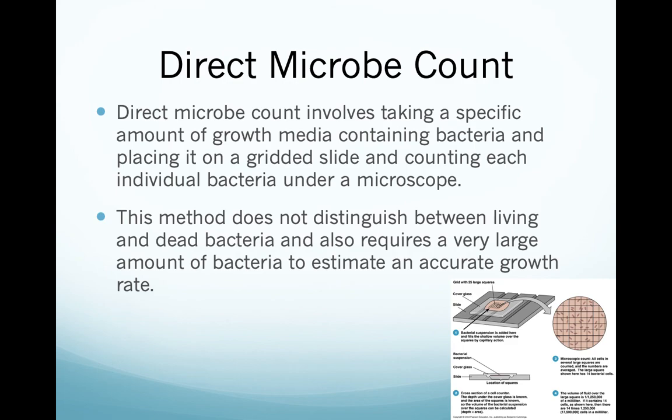The problem here is you need a really large sample to get an accurate estimate of growth. So you do this once, you wait 10 hours, you come back and you sample it again. Are there more bacteria? Are there less bacteria? Then you wait 10 more and you come back and do it again. Are they increasing? Are they decreasing? Once again, you can't tell living versus dead underneath a microscope, so your numbers are always going to be flawed. You're just counting the number of overall bacteria.